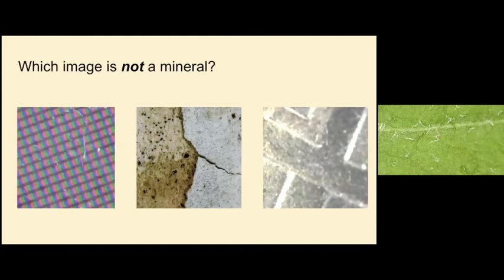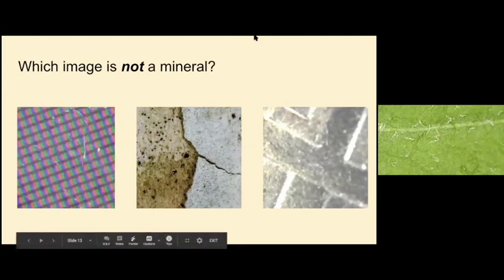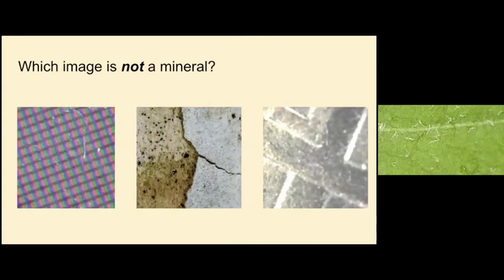So I'm going to ask my friend Chloe to make some observations for us on these three. This is a pretty tricky set. The only animal that has a gray-looking stone body is an armadillo, but none of those look like armadillo since they have bands. That's a good observation.